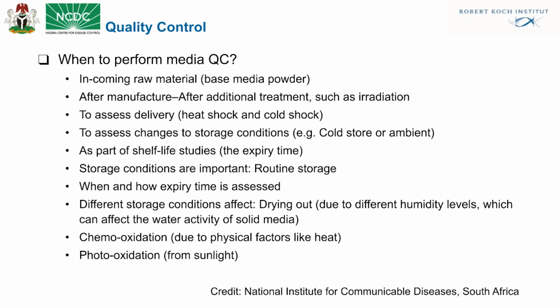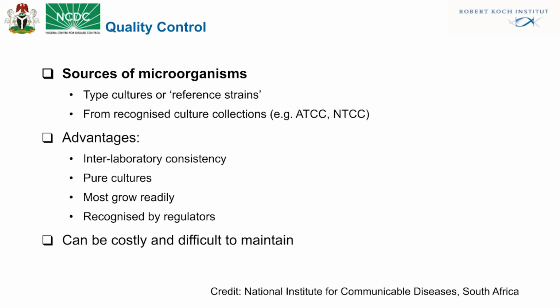Different storage conditions affect drying out due to different humidity levels, which can affect the water activity of solid media. Chemo-oxidation due to physical factors like heat. Photo-oxidation from sunlight. Sources of microorganism, type, culture, or reference strains.